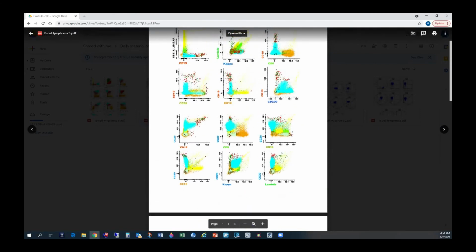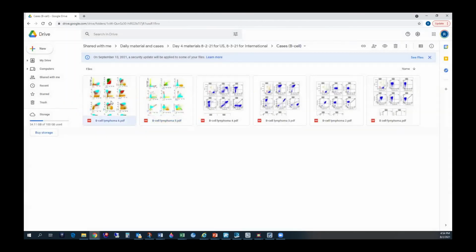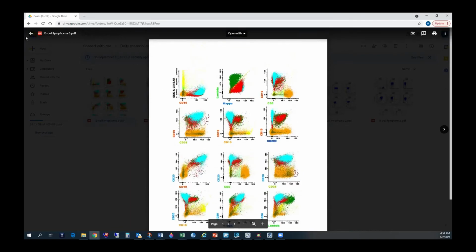Actually, I'm going to show you the reports that we used to have at MSK, if we get the time, maybe today, as to how the reporting would be done on these cases. We used to have templates for these cases, and I'll show you the templates. But anyway, I was saying that this case we should definitely have in our book. Yes, I love this. Let me see what I had, the other one. Maybe we can do this case tomorrow.